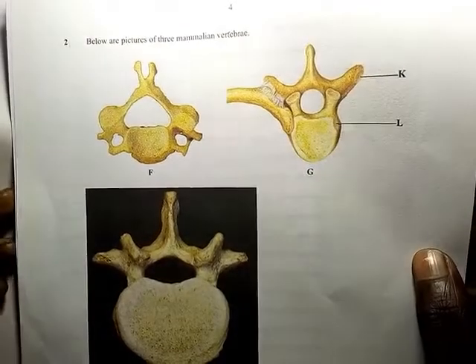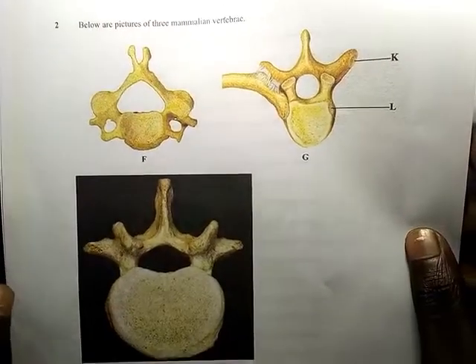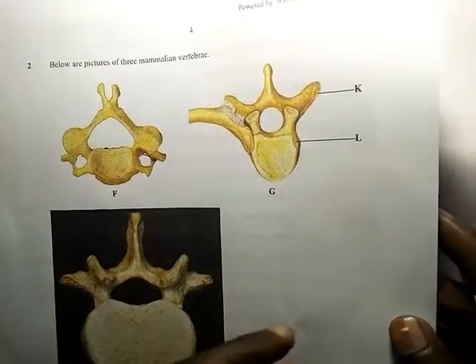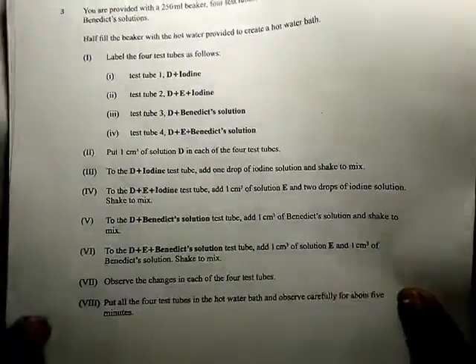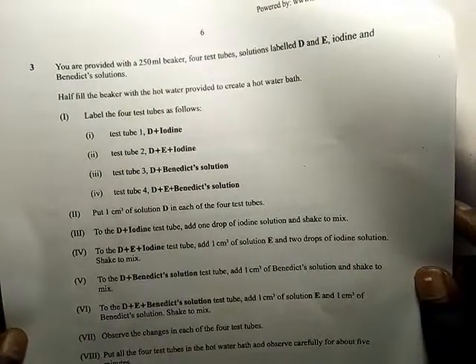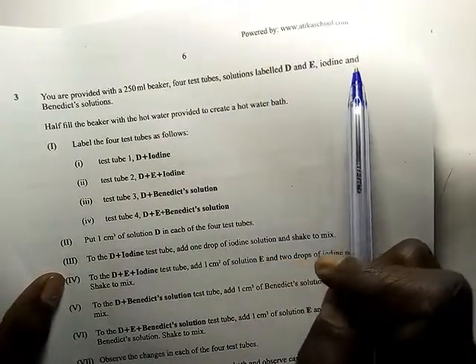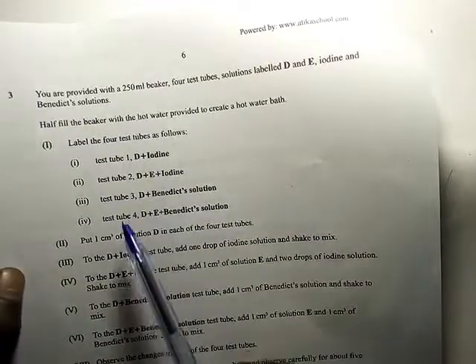The second question is from bones. You are required to study them and identify the question you are given carefully. And lastly, question three is for food test. As you see, you are provided with solution D for test tubes, iodine, and Benedict's solution. Now let's start with question one.